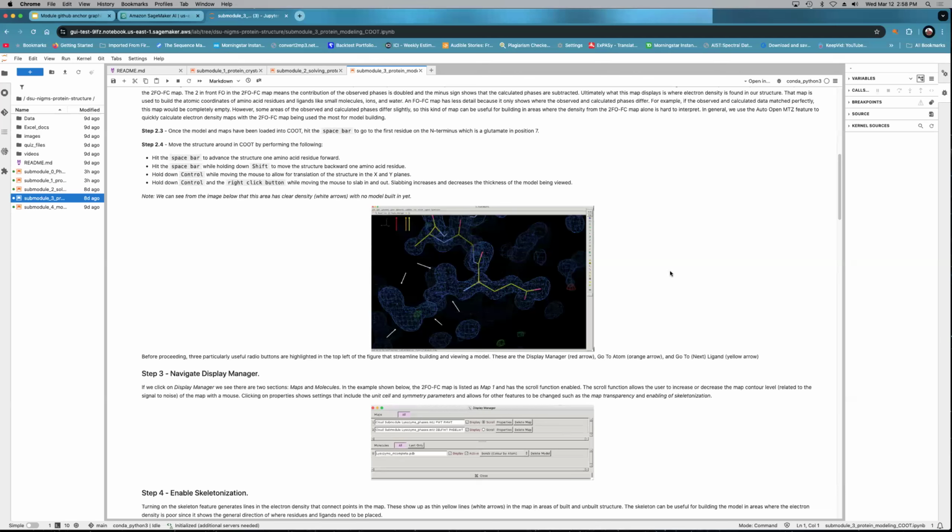So we'll be using a couple data sets that are pretty easy to interpret. Now, if you were actually doing crystallography and collected a data set that was 4 or 5 angstroms, it would be very challenging to build in some of the structure. This is a data set that's closer to 1 angstrom, so it looks like all of the atoms are shrink wrapped by this electron density. If you have the luxury of working with something like that, it's great, it's pretty easy.